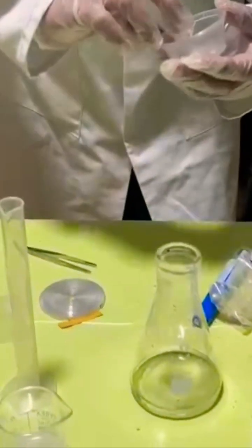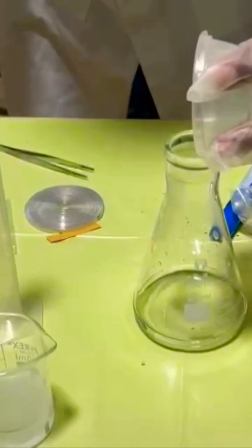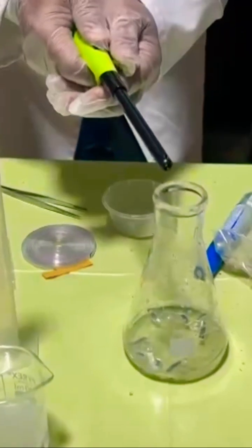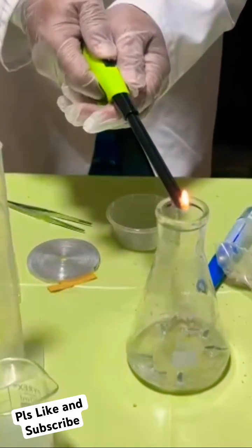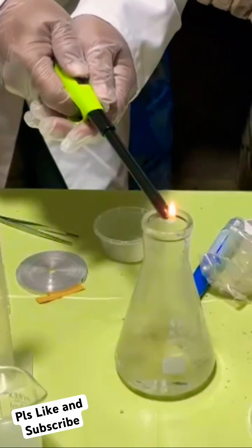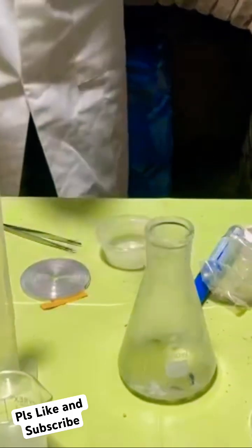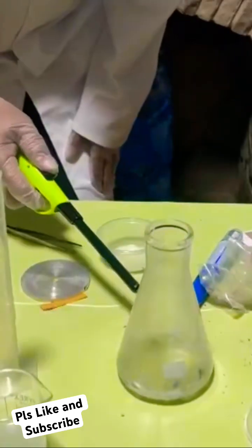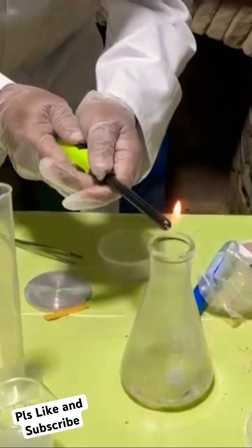Now I want to quickly add all the magnesium ribbon into the acid so you can see that reaction. There are still some bubbles coming out — those bubbles are nothing but hydrogen gas.